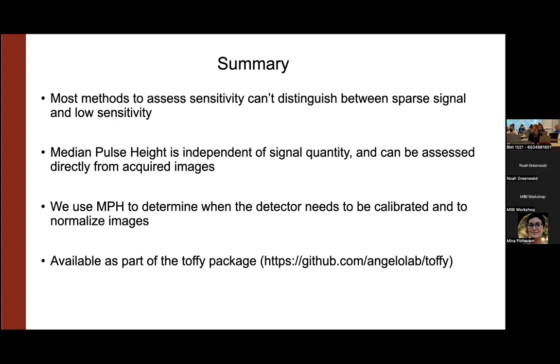Yeah, because even in some preliminary titrations of some old samples and then going to the specific non-primate samples, there's a significant difference in brightness and intensity. And so that's where I was wondering if that's something. Yeah, the question with all this gets back, because we wouldn't have MPH as a readout, you would need some way of knowing the ground truth of how much had been impacted. Because you're going to have samples that are dimmer just because biologically they're dimmer.